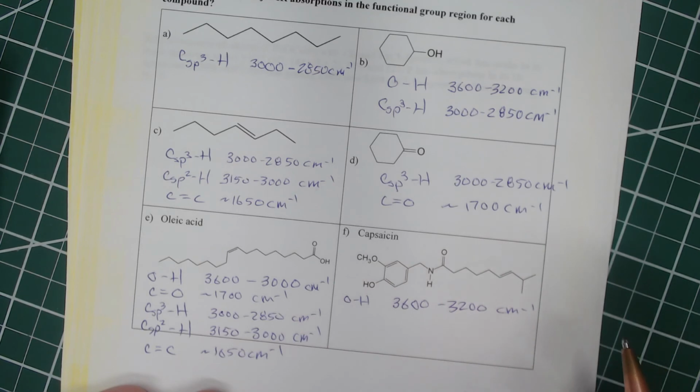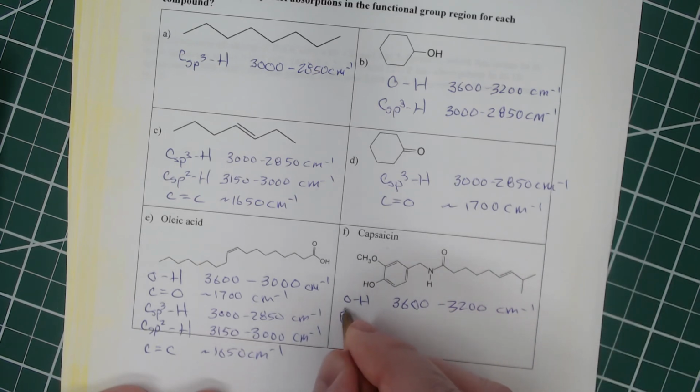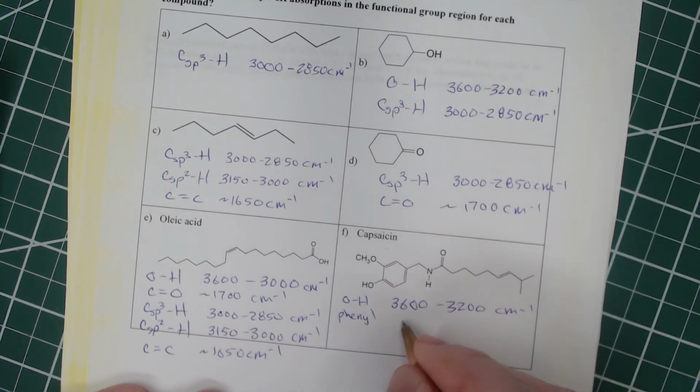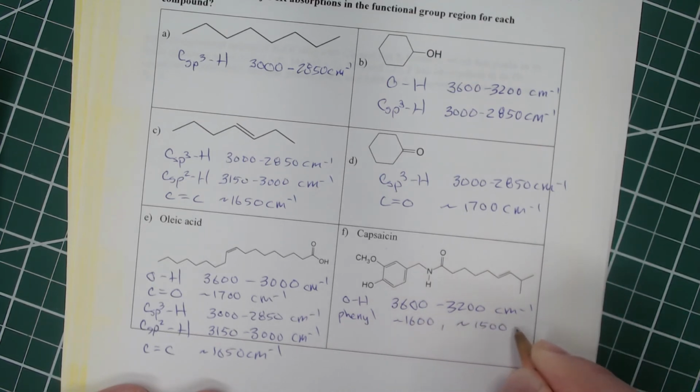We'll do the phenyl group. And there's multiple things that are going on. That's why we get a double peak. But we get one that is at about 1600, and one that is at about 1500 reciprocal centimeters. So there's two peaks that are involved for the phenyl.